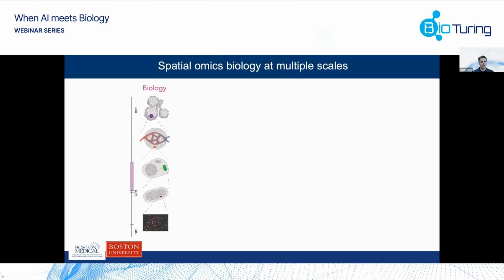So how did we think about how we should build the next Giotto version, Giotto Suite? We looked at biology, and the first thing we noticed is that a lot of biology doesn't necessarily happen at the single cell scale, which is what we originally, coming from the single cell RNA-seq field, always assumed. There's a lot of biology happening at individual transcripts or at organelles, and going from a single cell, you can go through a multicellular organism, even to full tissues. So we wanted a way to represent all types of information from all different spatial scales.